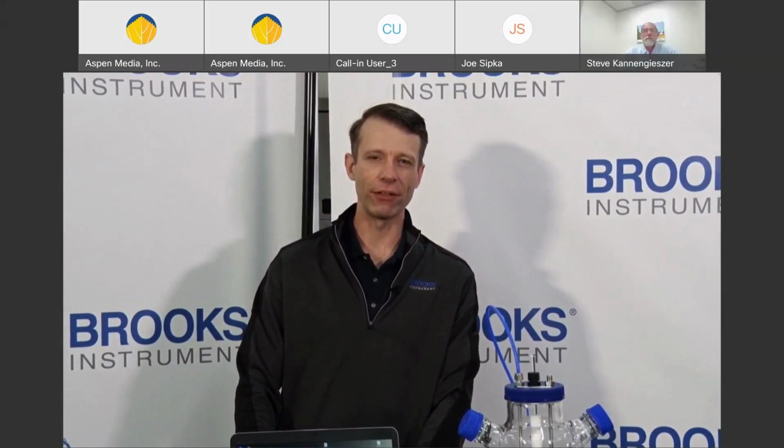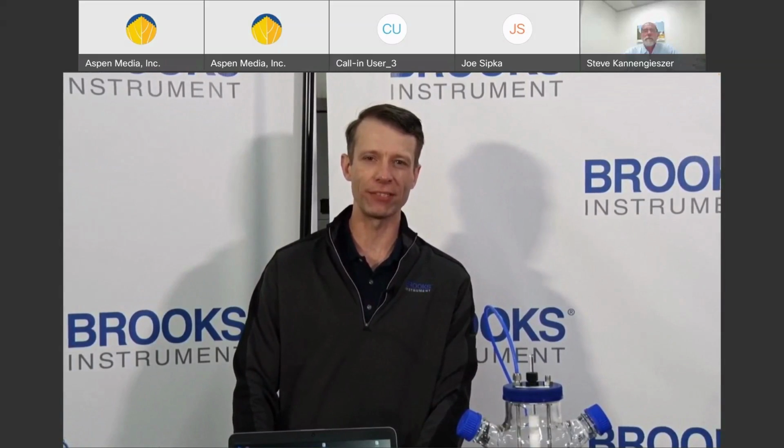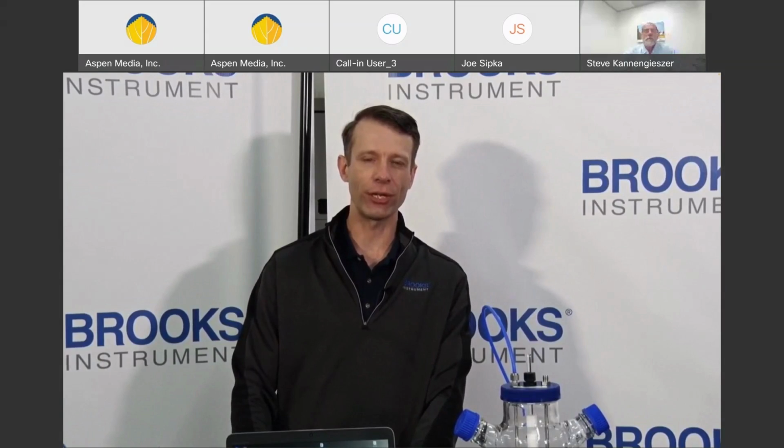Inaccurate zero can lead to lost time tracking false leaks, or even worse, cause shifts outside of the accuracy specification of the GMP process. If accuracies fall outside of the GMP specification, it will trigger an explanation report to indicate why a product can still be run through the system, leading to burdensome administrative work.